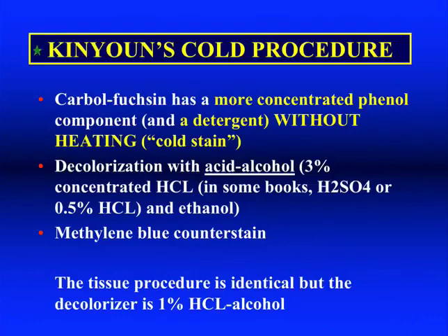Then came Kinyoun, and he used carbol-fuchsin, but he used a more concentrated phenol, and he added a little detergent, and it allowed the carbol-fuchsin to go through those walls without heating. And that was revolutionary. It became a cold stain. He still decolorized with a harsher acid alcohol decolorizer and the same methylene blue counterstain.